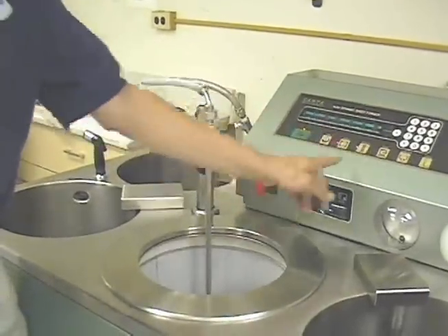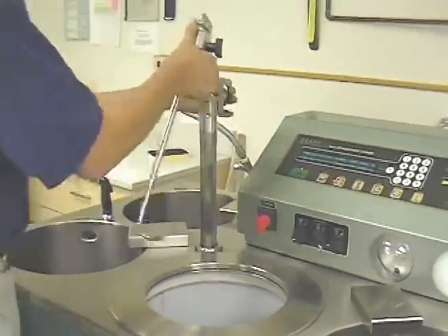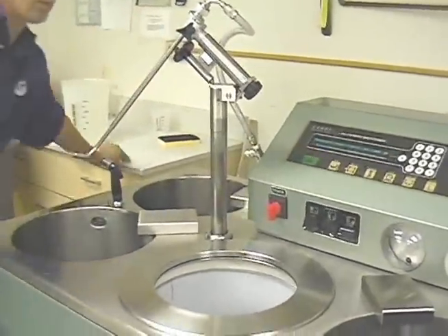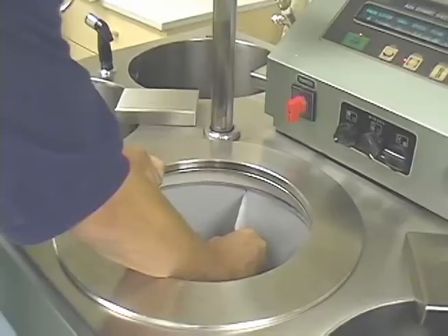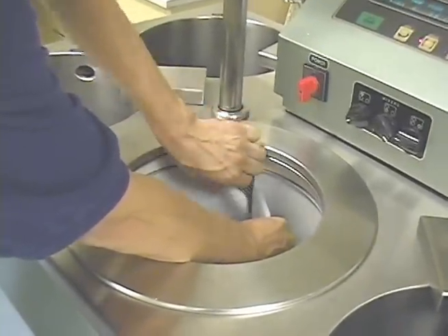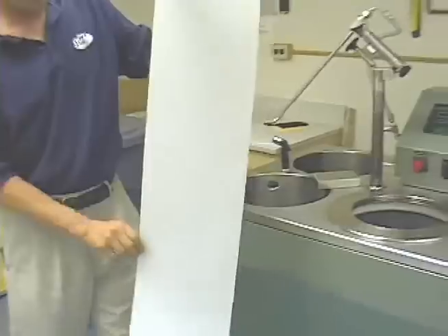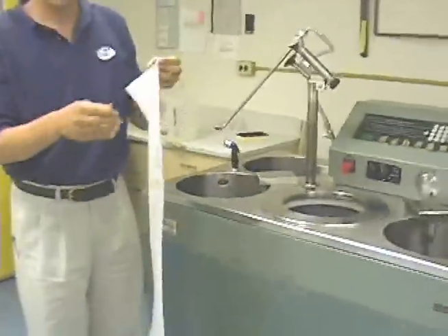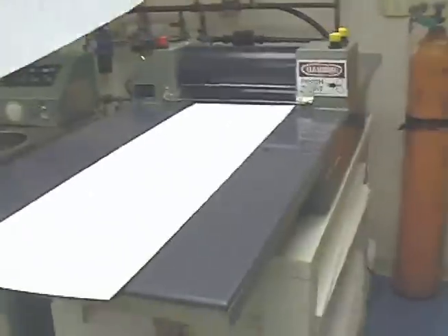Other setups of the machine may be stored in memory as well. This feature of the Campa sheet former ensures repeatable sheet making conditions. After the nozzle is brought to the upper position, it is swung out of the way. To make the next sheet, the nozzle will be repositioned in the exact same location relative to the drum, without the need for adjustment, due to the positioning device. The operator then removes the sheet from the drum with the forming fabric.